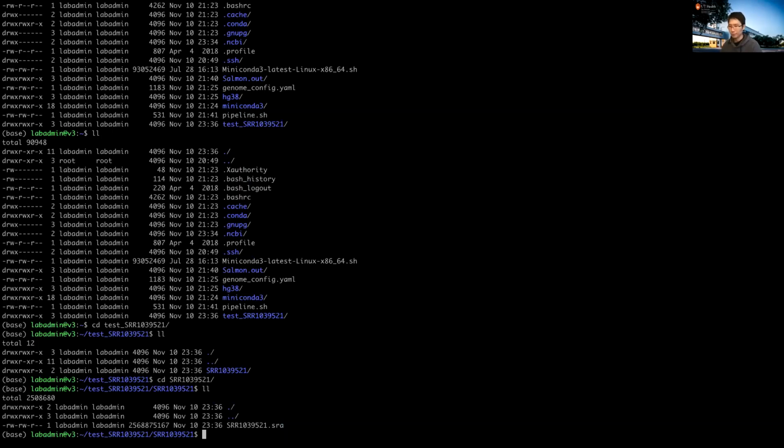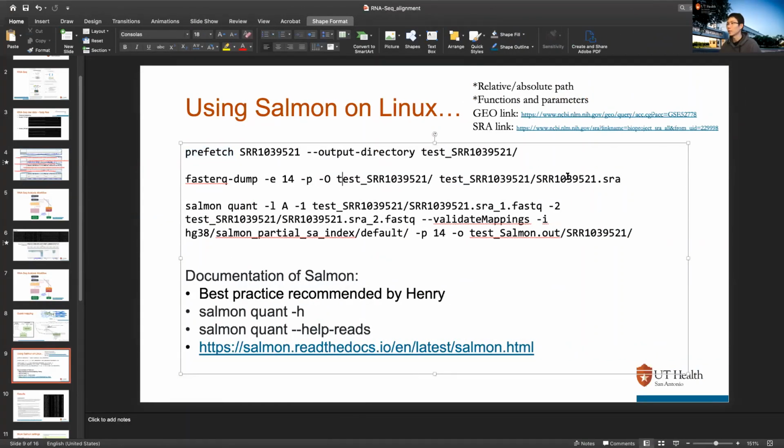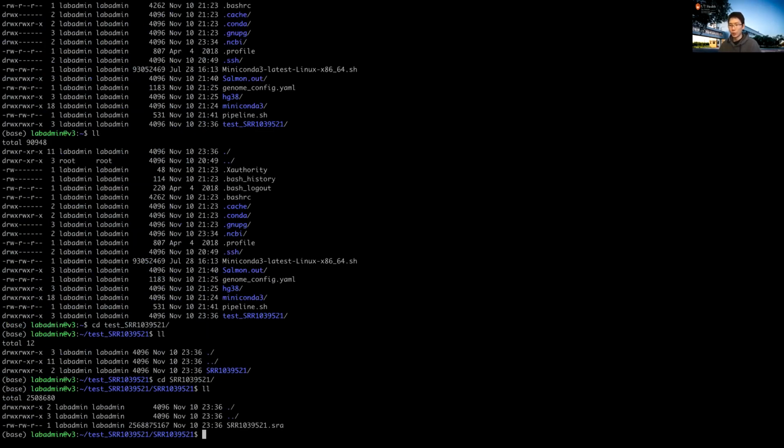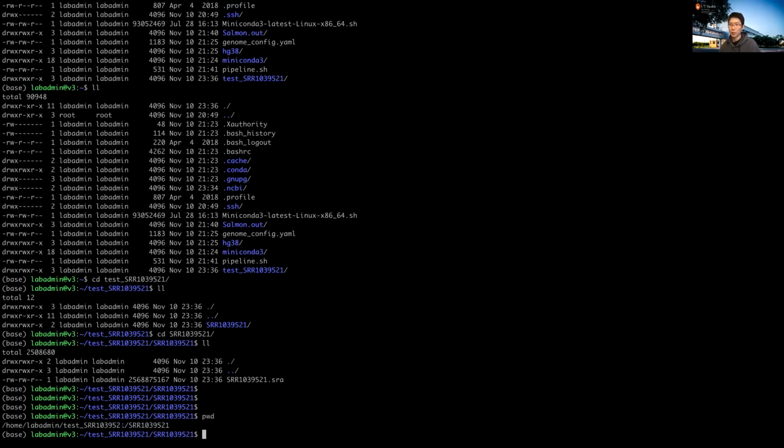Okay, so let me directly copy. The second line we'll be running is this one. I'll paste it to the chat box right here. Remember, now we are at this directory, so you can hit pwd. So now it's where we sit right now.